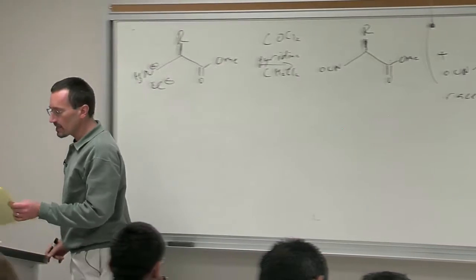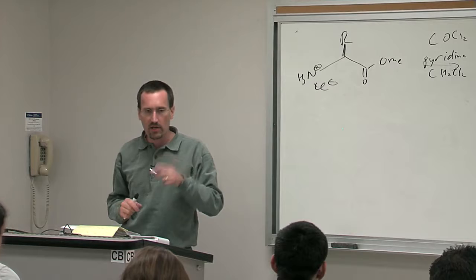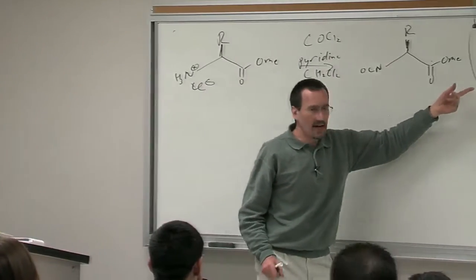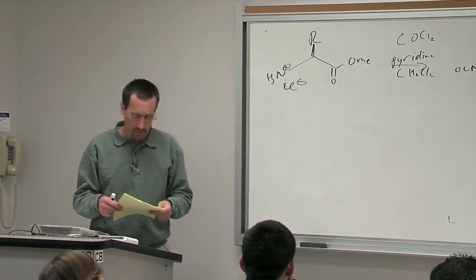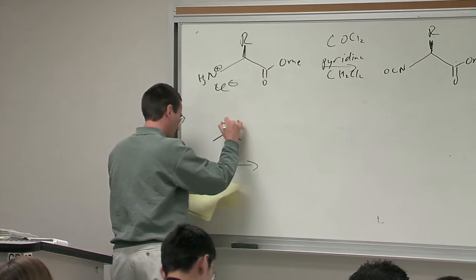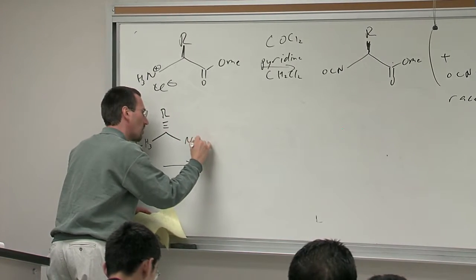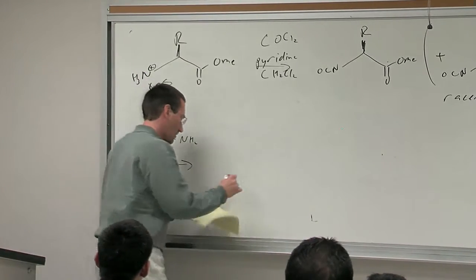So in this case, it's kind of the antithesis of the isocyanate being in the derivatizing agent. Here, the molecule we were making had an isocyanate in it, so I just derivatized it by reacting it with methylbenzylamine. And so, as I said, you can get methylbenzylamine as a single enantiomer. I happen to take the R enantiomer here. So we treated it with that. And the idea was to see if we were forming diastereomers.